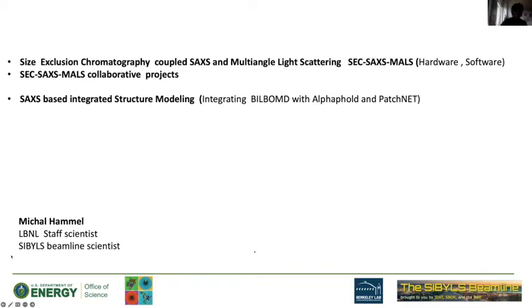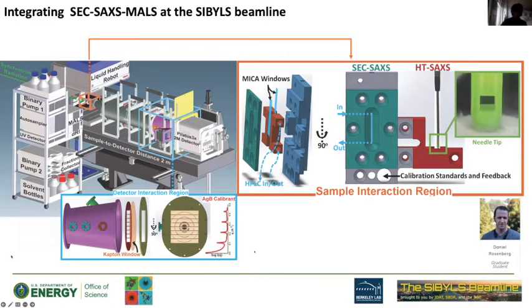Generally speaking, I can move my slides. So this is our current system. Greg mentioned the handling robot with the high throughput. Right next to it are two HPLC machines, because we can use more buffers to be equilibrated or collecting. Up to 8 buffers are available.